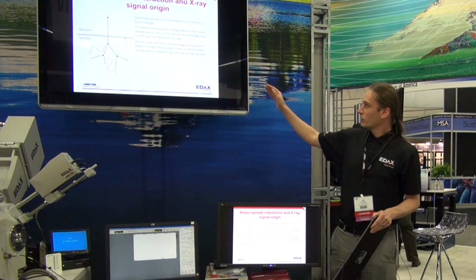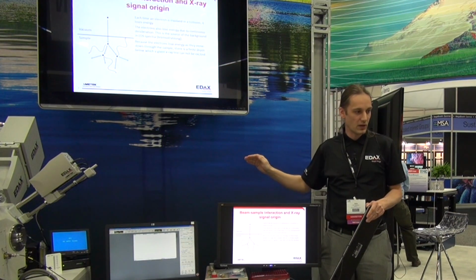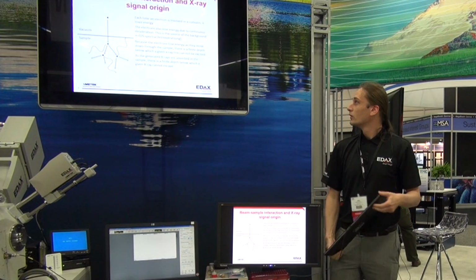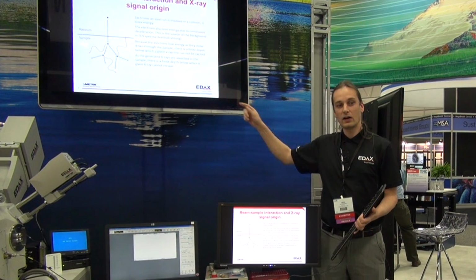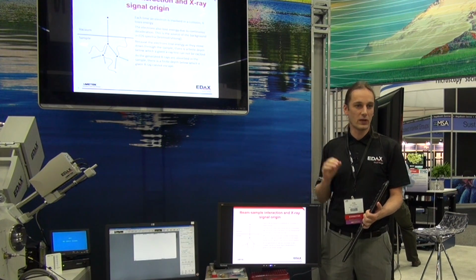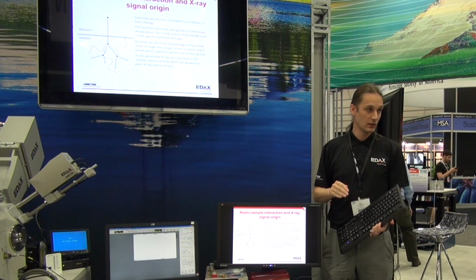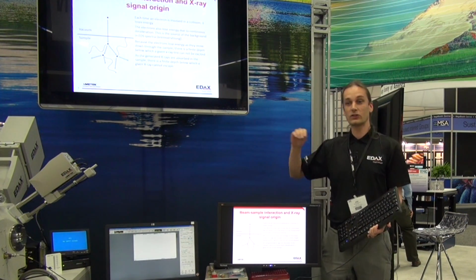So, since we lose energy from the top and going down into the sample, that means at different depths into the sample, we can excite different X-rays. But these X-rays that we generate down the sample, they are absorbed within the sample matrix. So one thing is how far down we can excite them. Another thing is what energy do the X-rays have to escape at certain depths. So just having an X-ray generated isn't enough. It also needs to leave the sample and get to our detector.